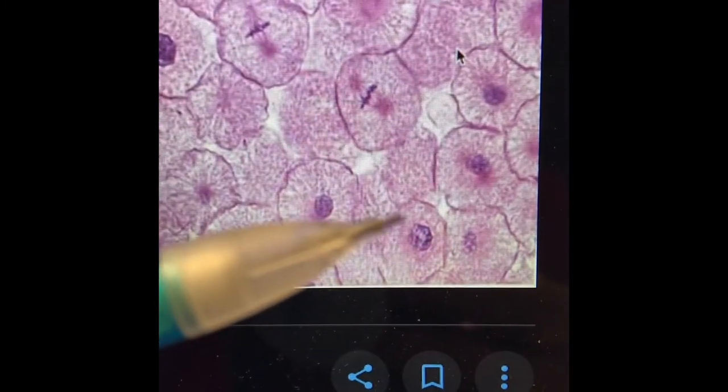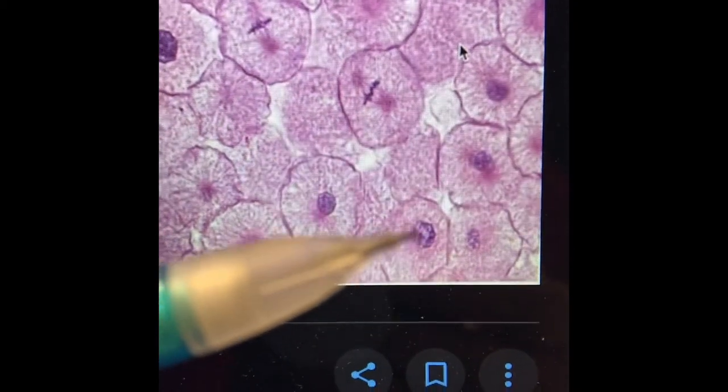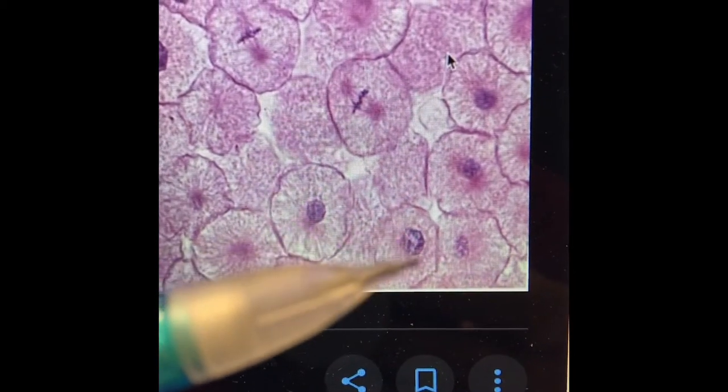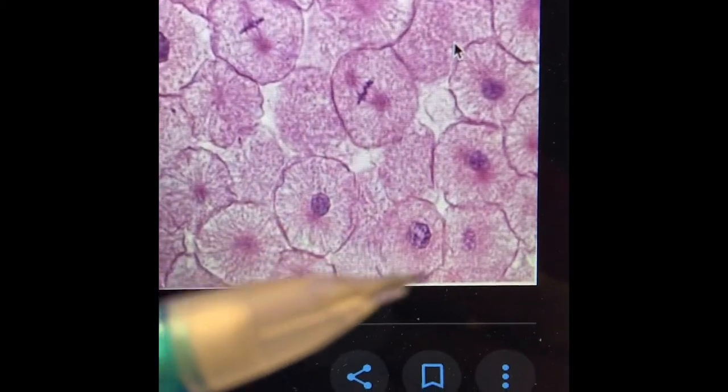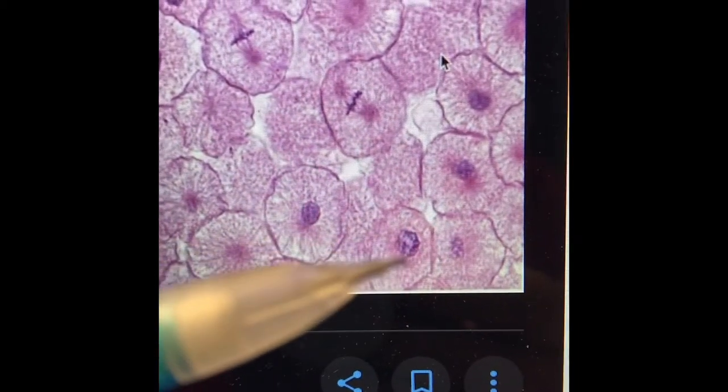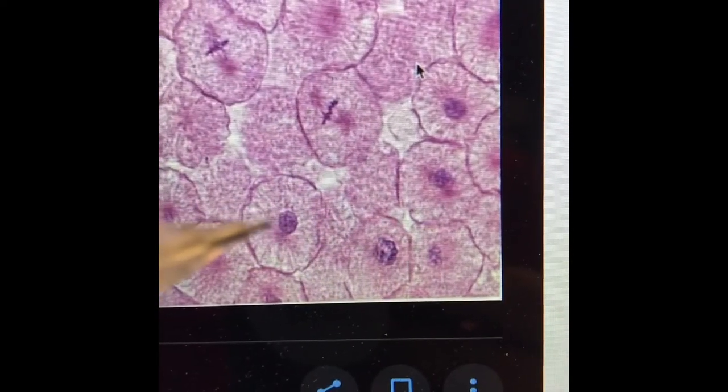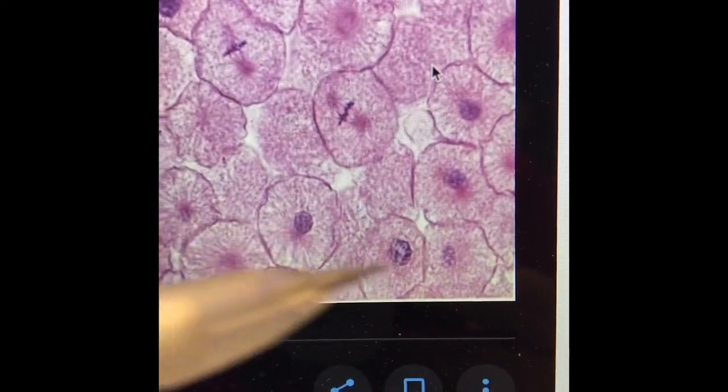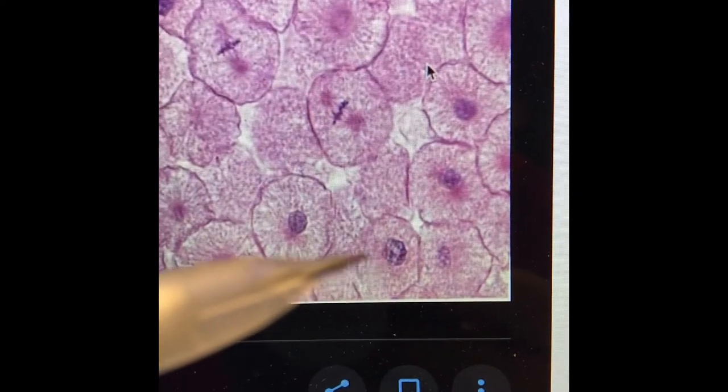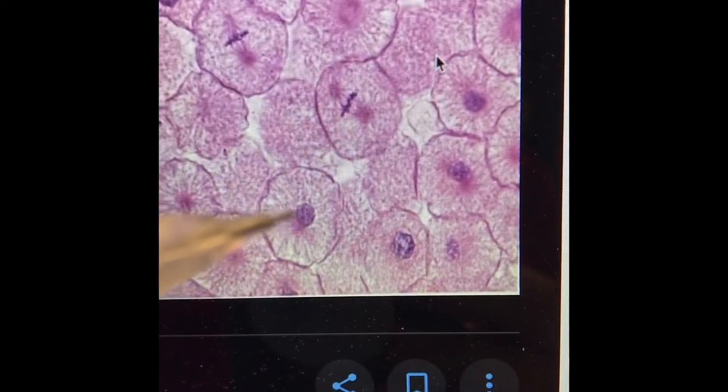But compare that to maybe this one right here. Which you see the nucleus looks a little larger. Because the DNA is thickening, coiling, and condensing. And the nuclear envelope is disintegrating. So if you just compare this one to this one. This is a great comparison of what my pencil is on now. Interphase. That's a great prophase. So I see interphase right here. Prophase.